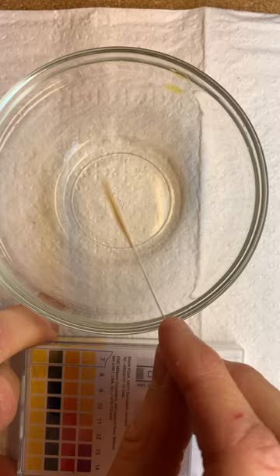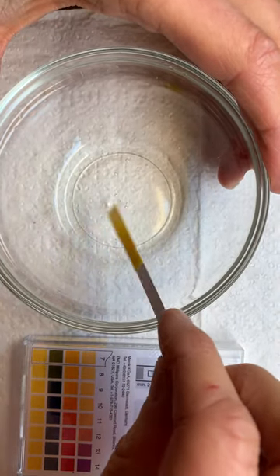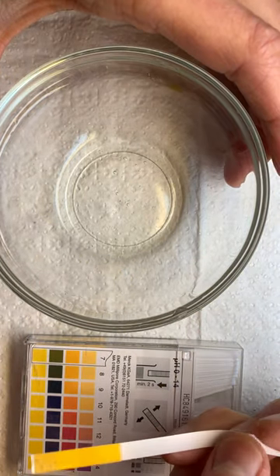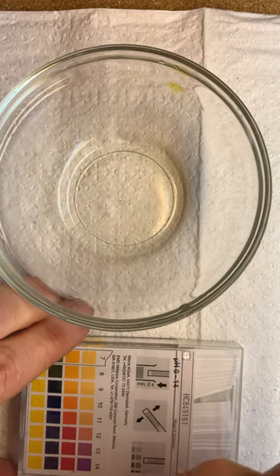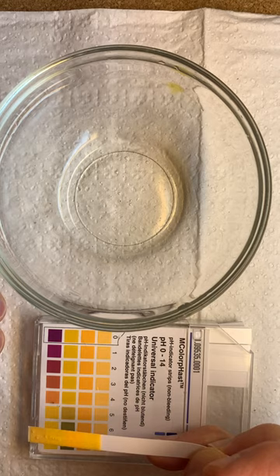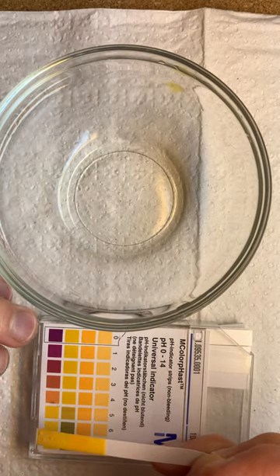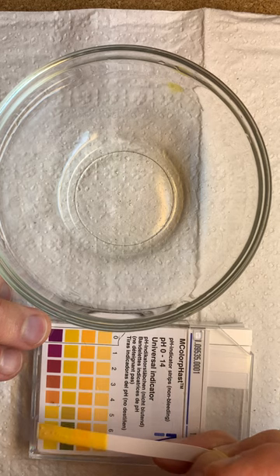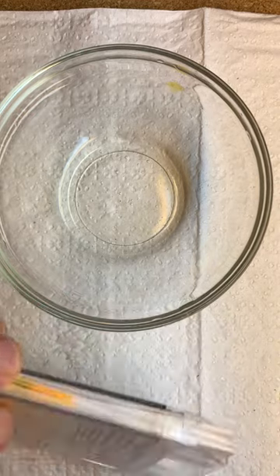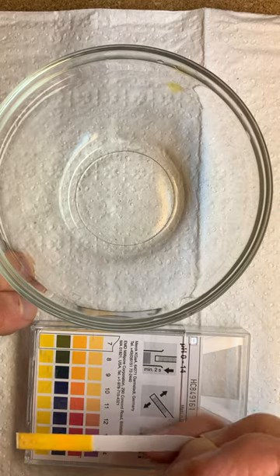Soap is usually a base. Let's see if this one is. There's a little color change here just to show you on this side. This one's more of an acid, isn't it? About a four? No, about a five. So this is a pretty acidic soap. It doesn't have a lot of stuff in it. Definitely not on the basic side.